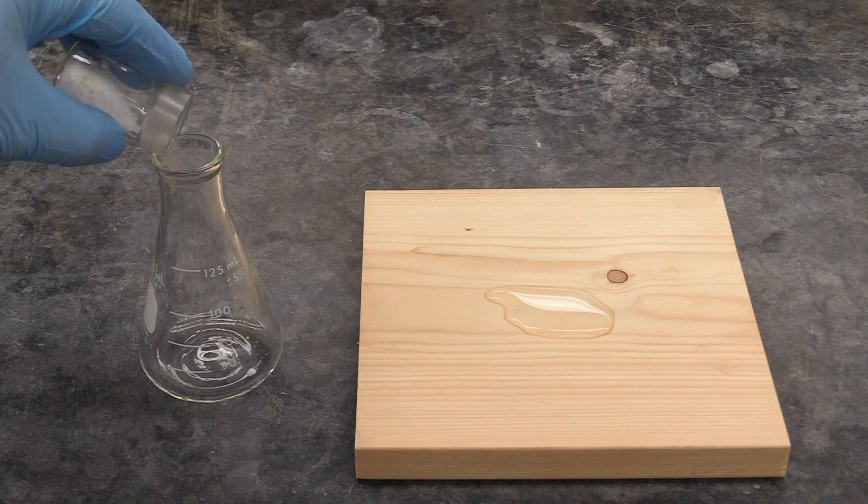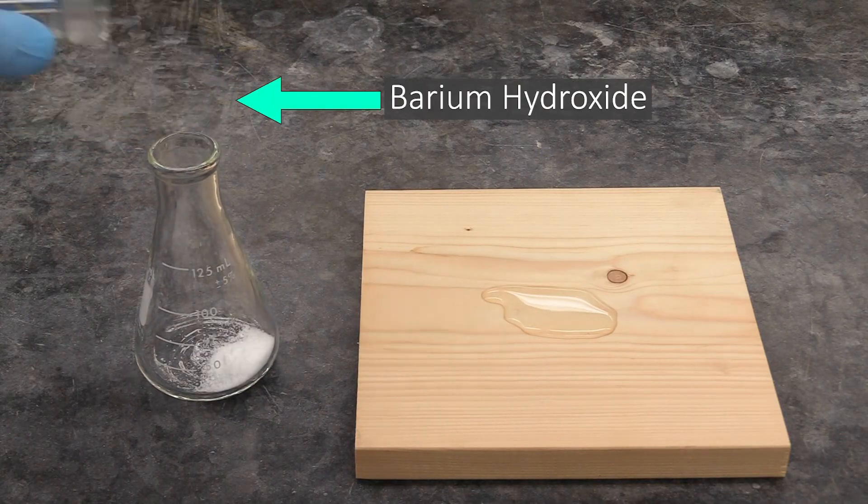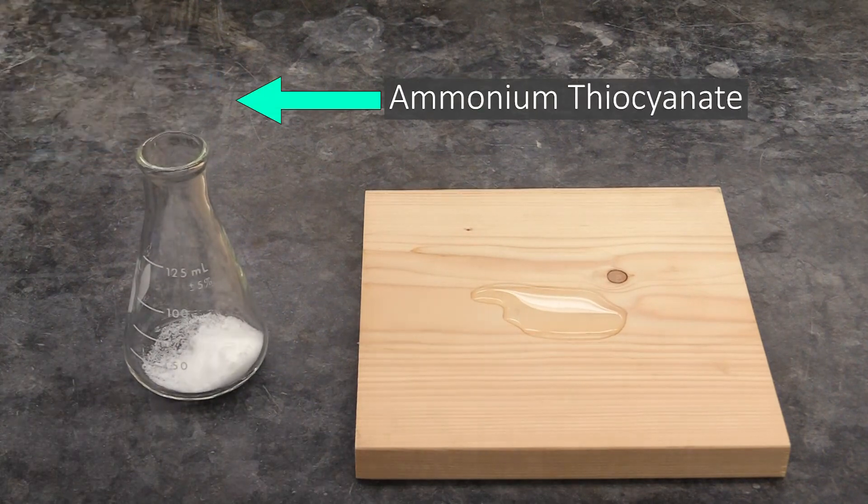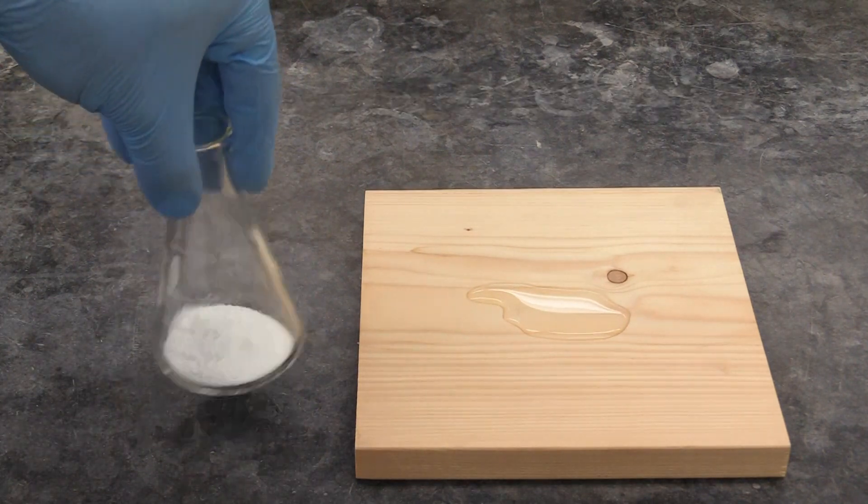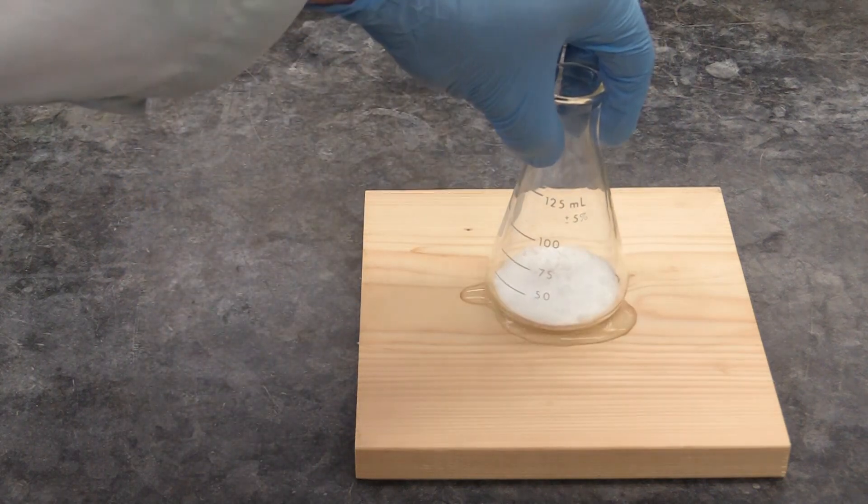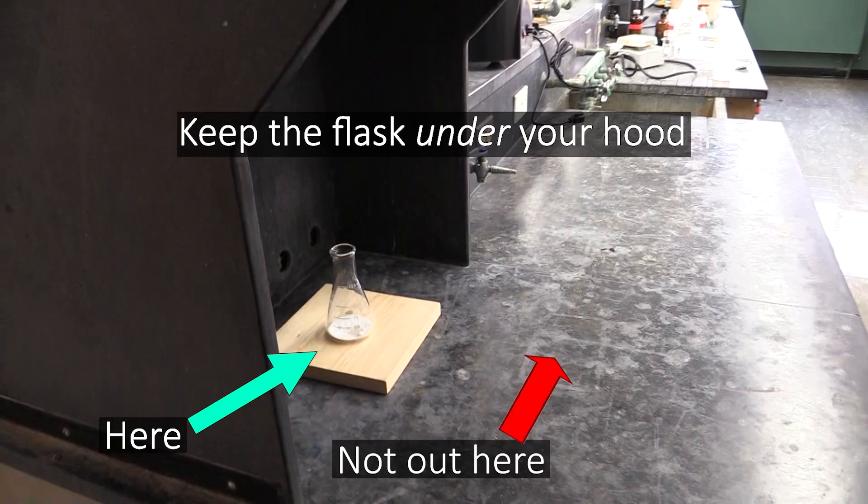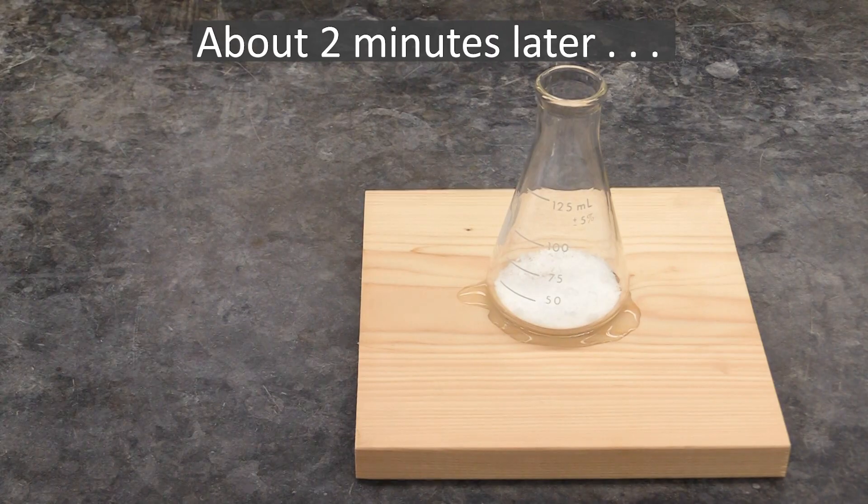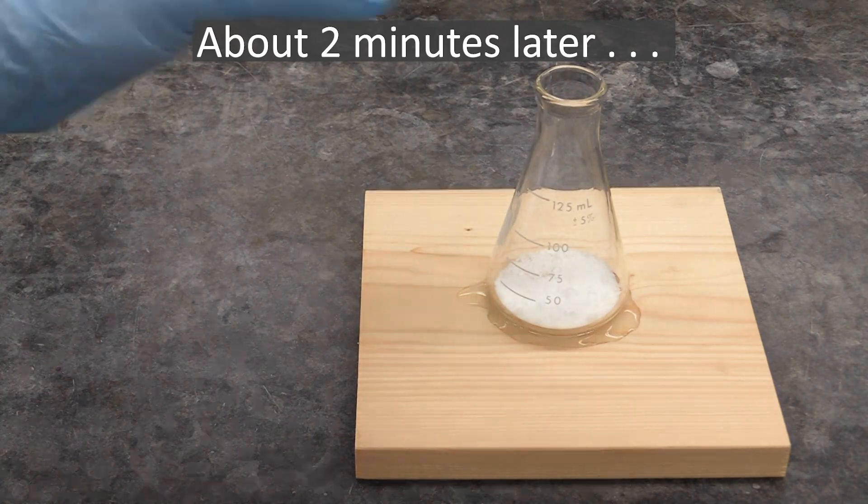For your first reaction, you'll add some barium hydroxide to a flask, then add some ammonium thiocyanate to that same flask, mix it up real good, and put it on a puddle of water on a wooden block. After a couple of minutes, you'll try to pick the flask up and watch what happens.